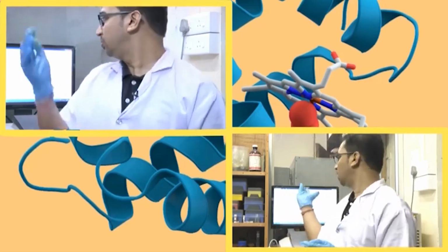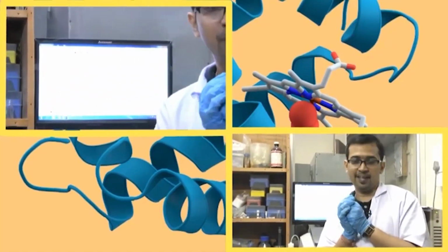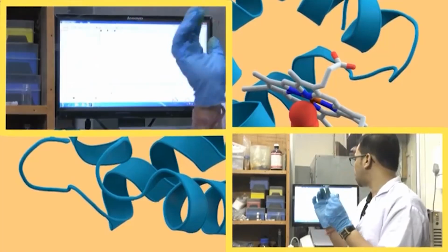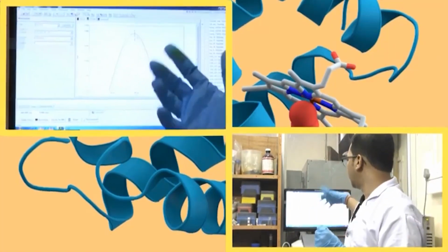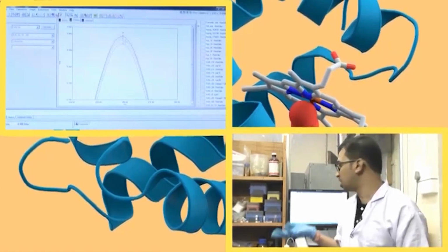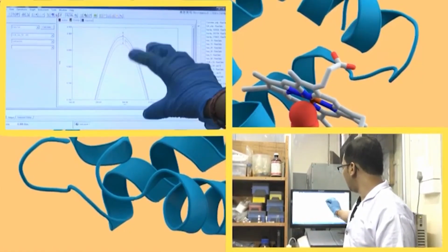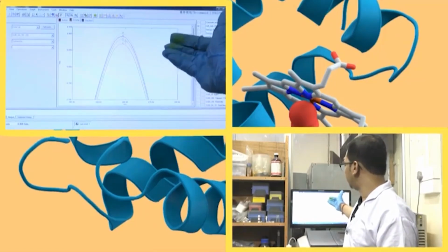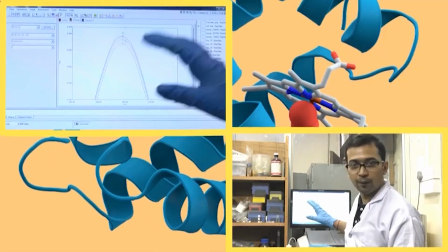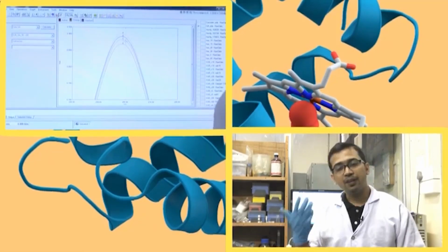Now, this is the change in the absorbance of our gallic acid in the presence of HSA. From here we can take the delta A in the region around 260, because it does not have any other absorbance region. This region decreases in a very systematic, regular way with increasing concentration of HSA, and we can plot this.